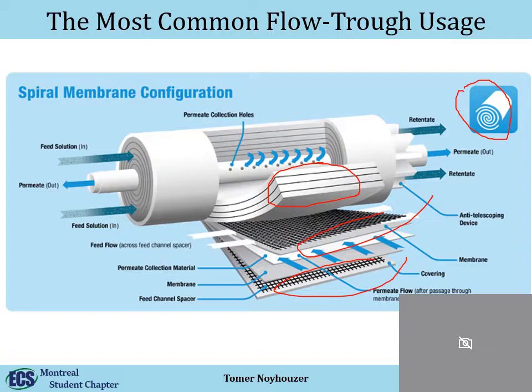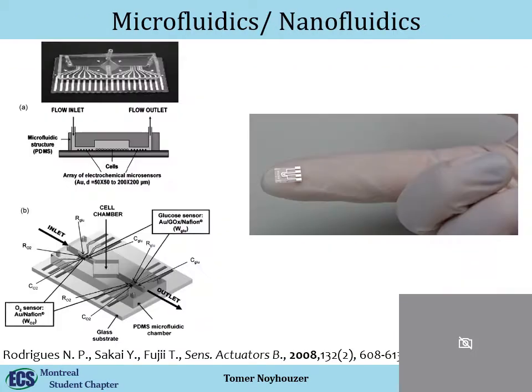And you have an outlet here and an outlet here, and the liquid will actually go through all of the layers, and you'll apply a constant potential, and metals that are in the water will be deposited on those nets. So you're actually removing heavy metals from the water, and later on you will just discharge all the metals to a waste solution. So it's still a flow-through, it's still an electrochemical flow cell. It's just not for analytical use, it's for cleaning water, but it might give you an idea, and I thought it's something that you need to be aware of.